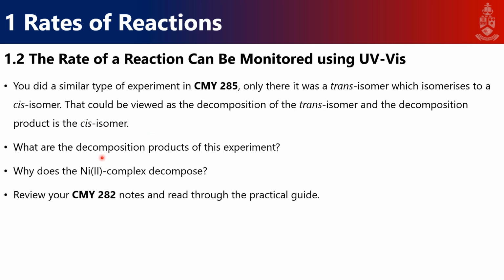However, here we're looking at a different kind of decomposition. So it's the same idea, just a different kind of reaction. You need to come up with what the decomposition products are. We're going to talk about what they are, but for now, you should have an idea of what the decomposition products are going to be. And of course, you can use the literature, so the Basalo et al. article, as well as the practical guide to help you to predict those decomposition products for this experiment specifically.